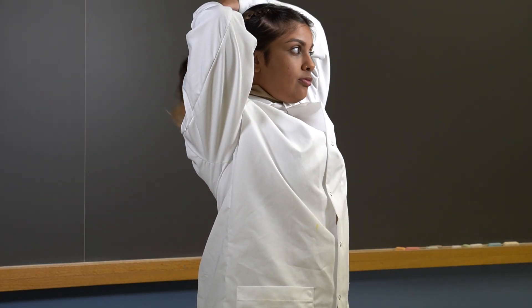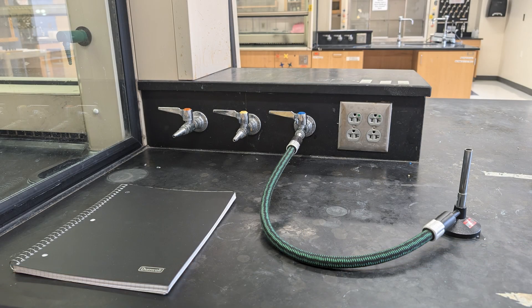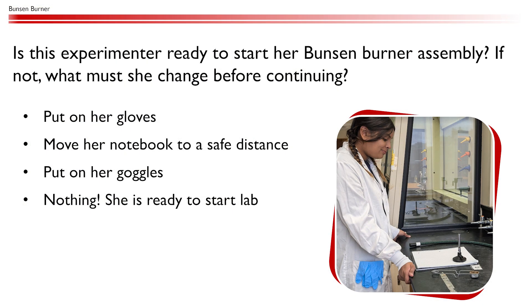Before we light the burner, we should ensure that all hair is kept back and all flammable materials such as notebooks and organic solvents are kept at a far distance. Is this experimenter ready to start her Bunsen burner assembly? If not, what must she change before continuing?